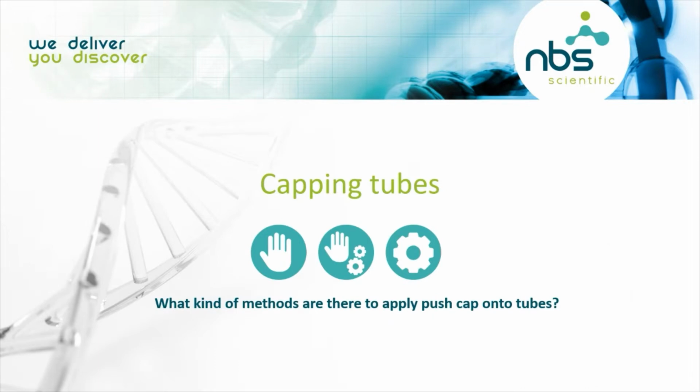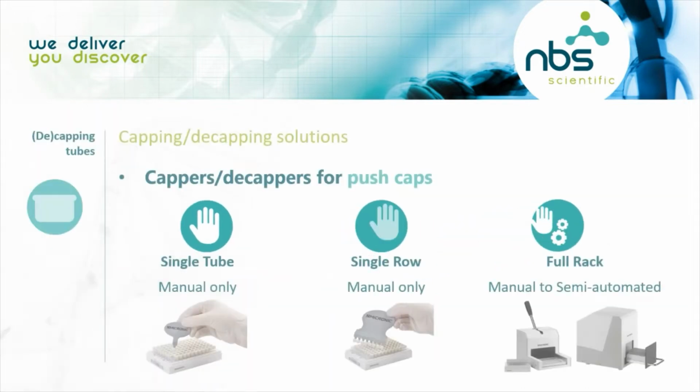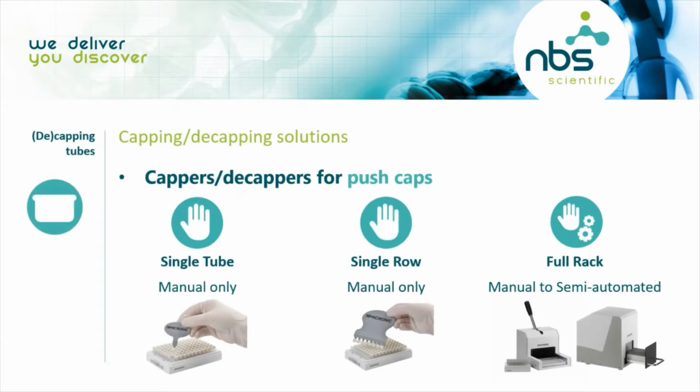How can we cap our tubes? Let's start with the push caps. Push caps can be put on the rack with a manual capper and a semi-automated capper. And decapping can be done manually with a single tube or single row decapper.